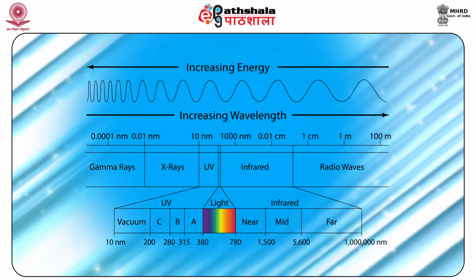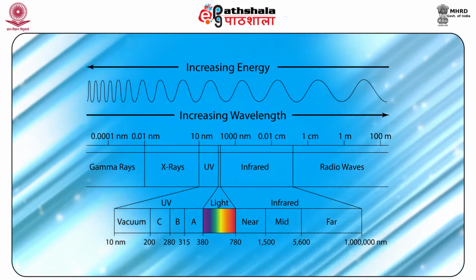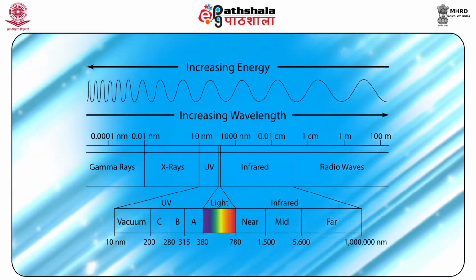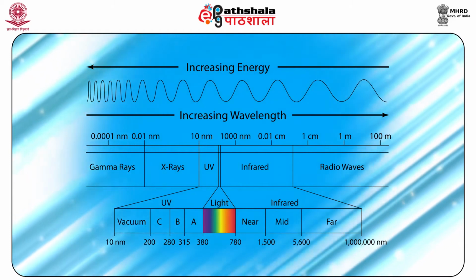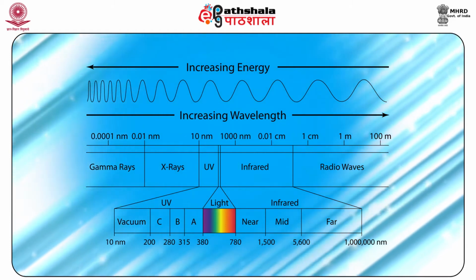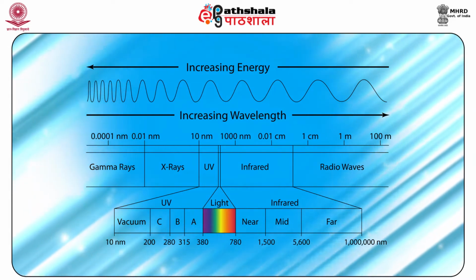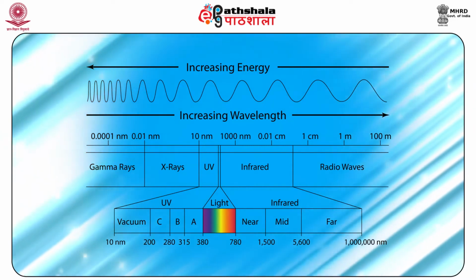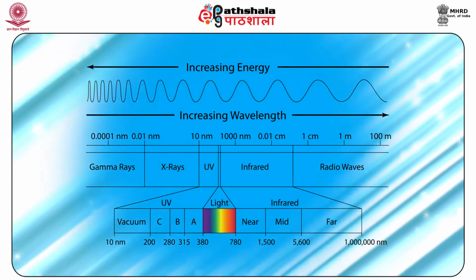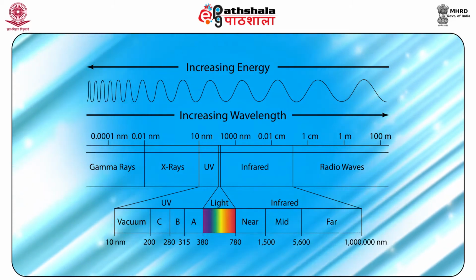Ultraviolet and visible radiation comprise only a small part of the electromagnetic spectrum, which includes such other forms of radiation as radio, infrared, cosmic, X-rays. The range of UV radiation is 200 to 400 nanometer, while the range for visible region is 400 to 800 nanometer.